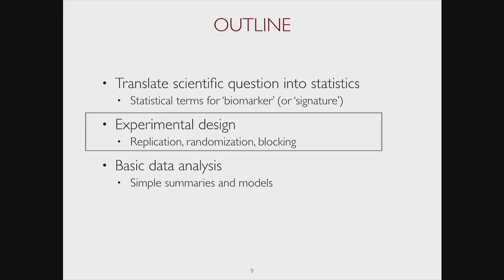Or are we already in the confirmatory stages of the experiment, where we now try to increase the sample size and go down to the specific predictive models which can potentially be used in clinic? And so this would mean different statistical methods, and this would mean different experimental designs.